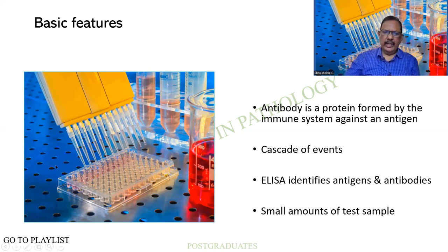And what we are seeing on the screen is amazing. There is a set of 96 wells, which are fed with the sample, and it is being delivered to each of the wells. The wells are fed, and then subsequently you find that the antibody, etc., is being added. You find that the microtips will be discarded. Normally there is a single sample for a single test, but sometimes multiple samples for multiple tests can also be used. Such is the advantage.